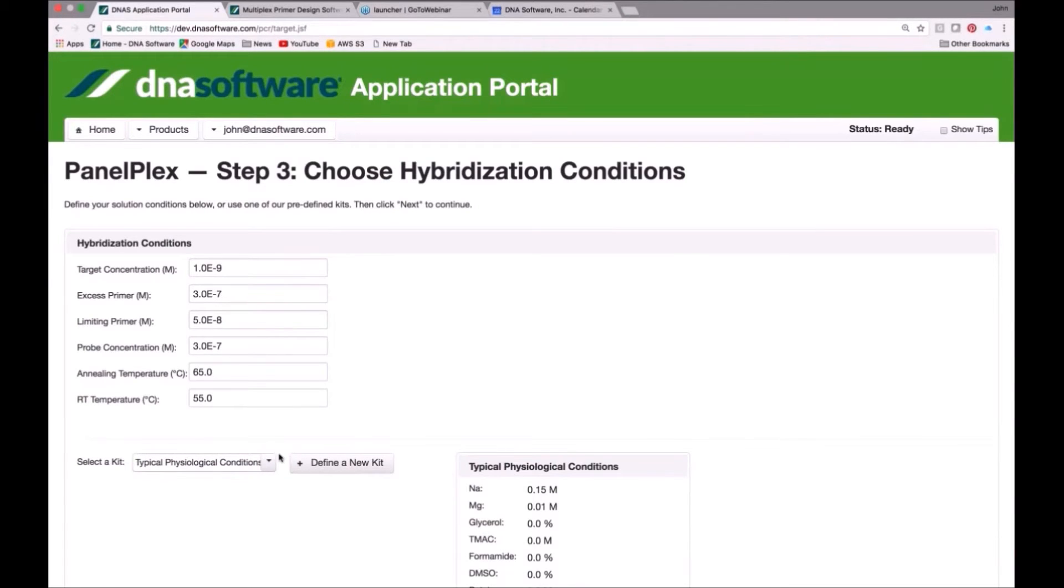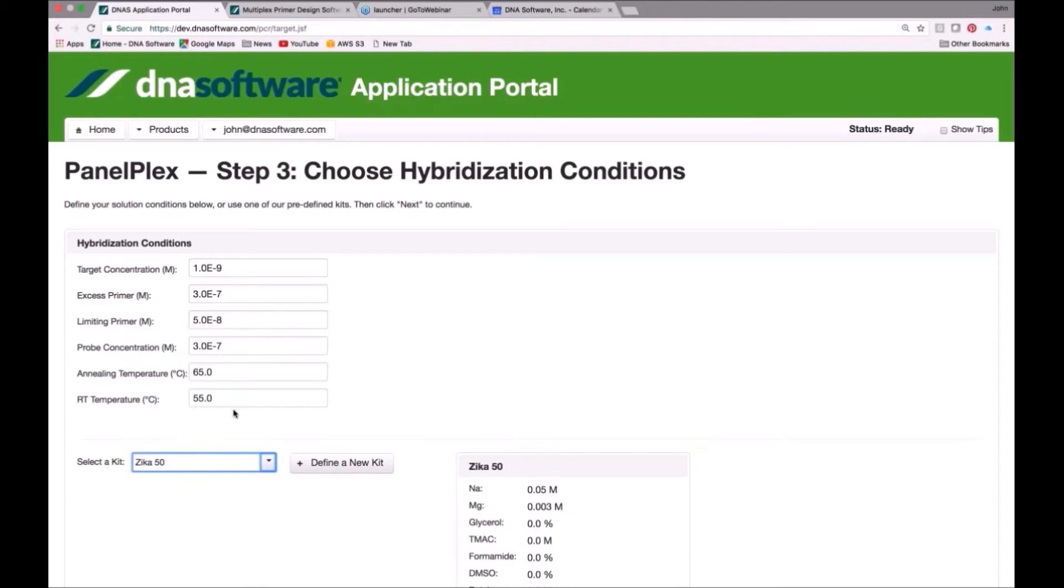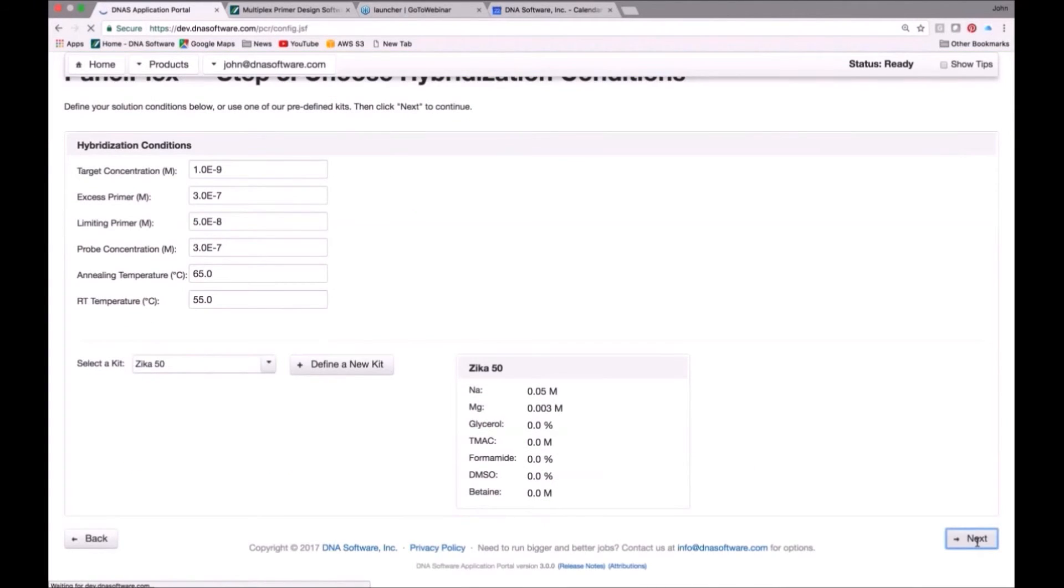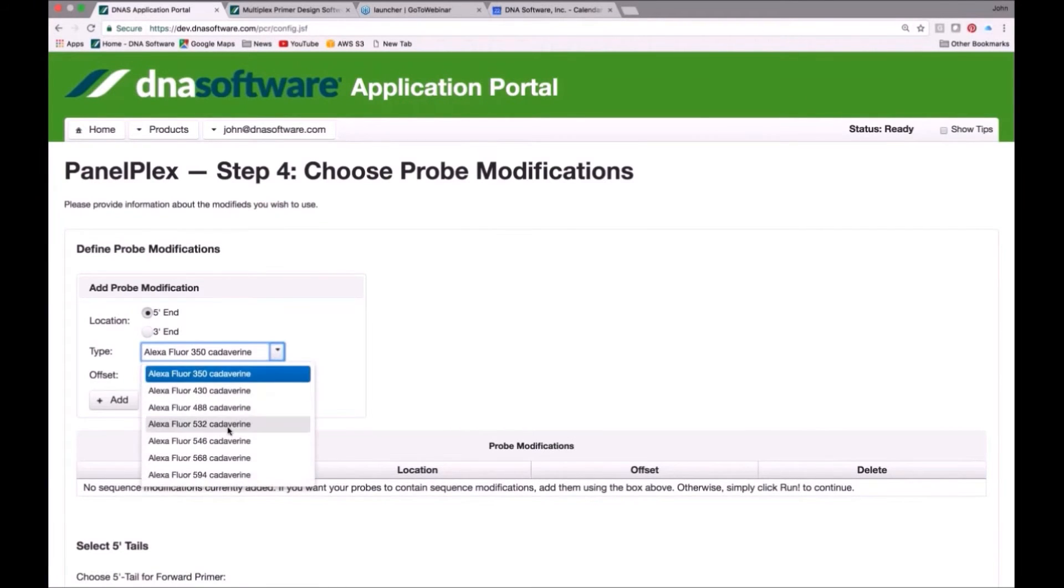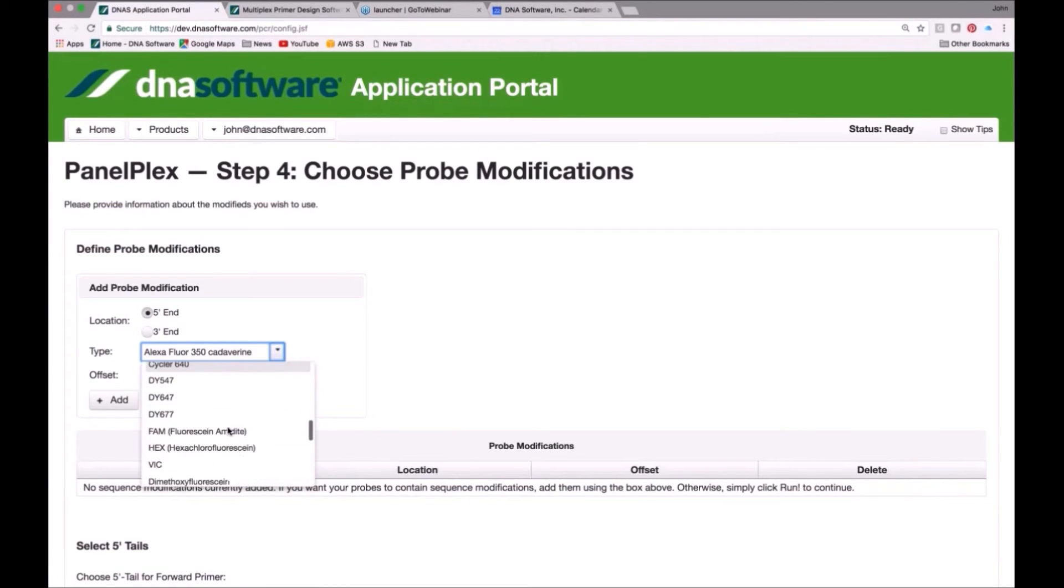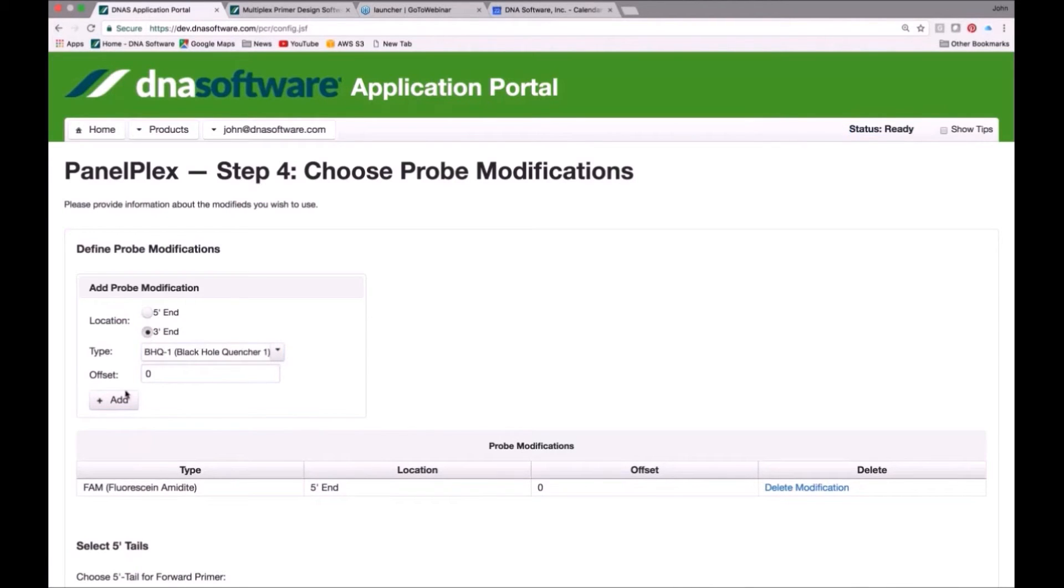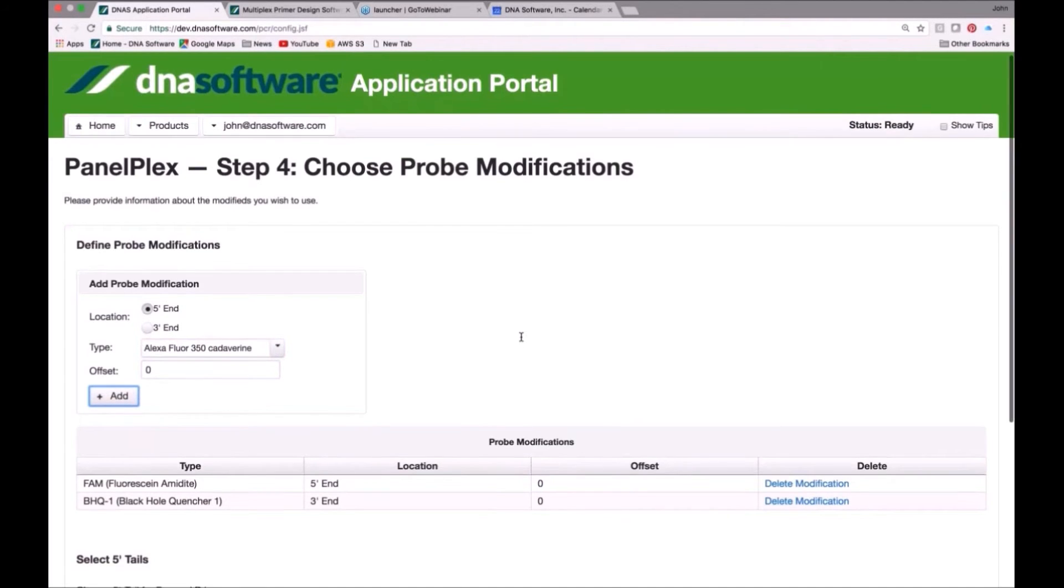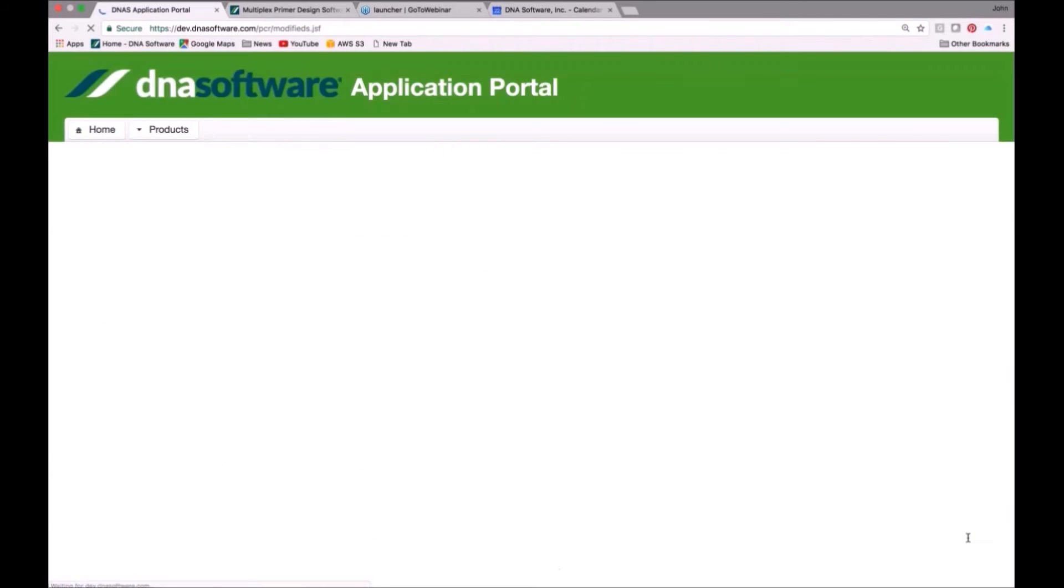Lastly, we have to choose our hybridization conditions, and I have one that I made up here for Zika. This is just a standard PCR condition in terms of the sodium and magnesium that are present in the solution. Lastly, you can assign modifications to your probe, which in this case, TaqMan probe. I could choose fluorescein as the 5' end fluorophore and BHQ quencher as the 3' end quencher. And that's it. You hit Run, and the job is submitted.